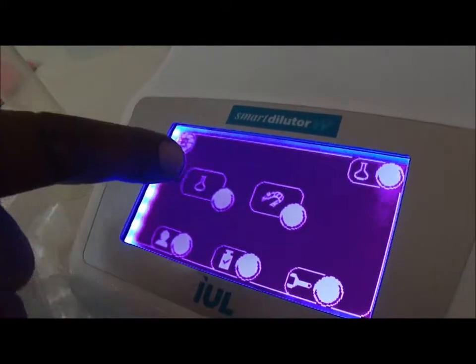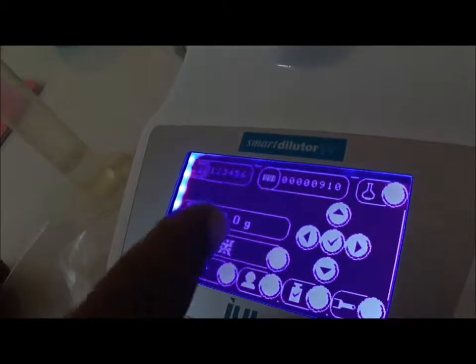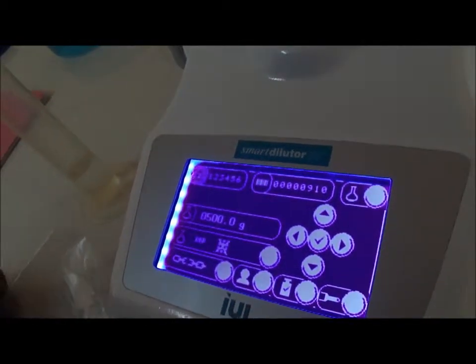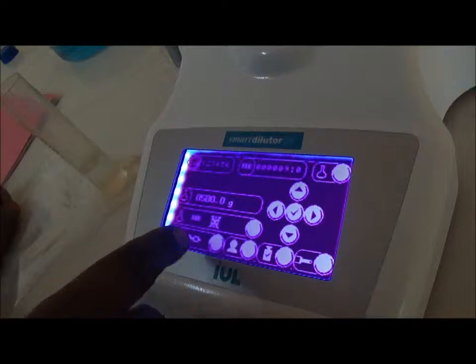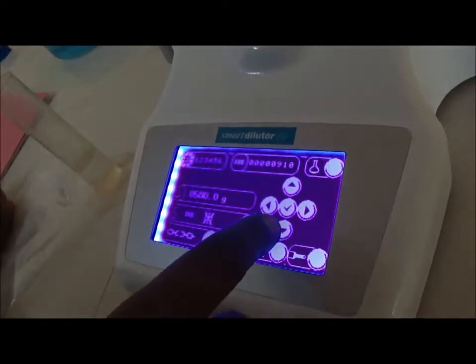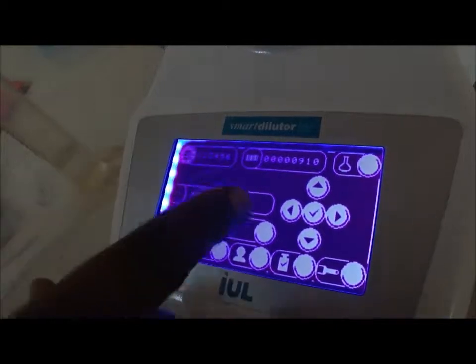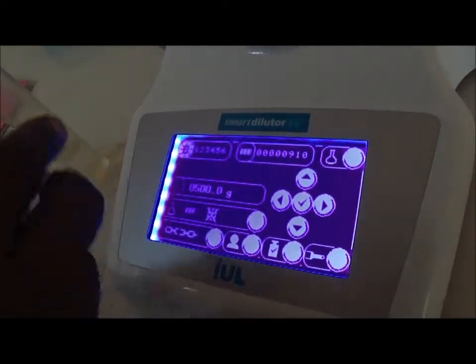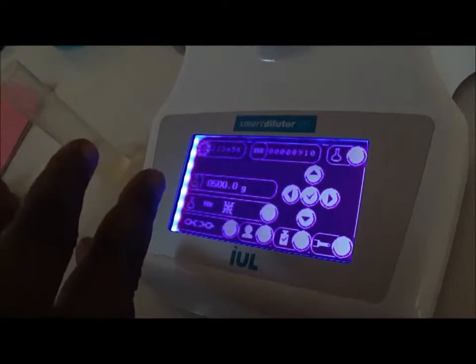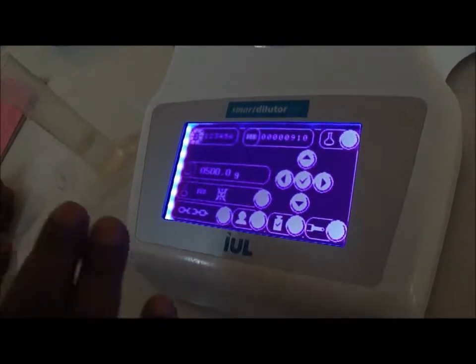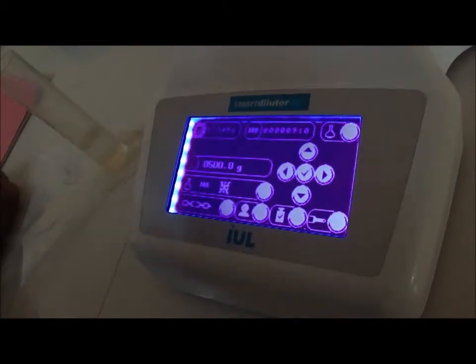Then you can put here dilution or dispensing. In our case, we have selected this one and we enter in the menu where you can give a number to your sample, an ID. If you put down this triangle, you move between the fields and you have in the middle here where you put actually the final weight you want for the mixture of your diluent or the solution you want to mix with your sample by making a dispensing.